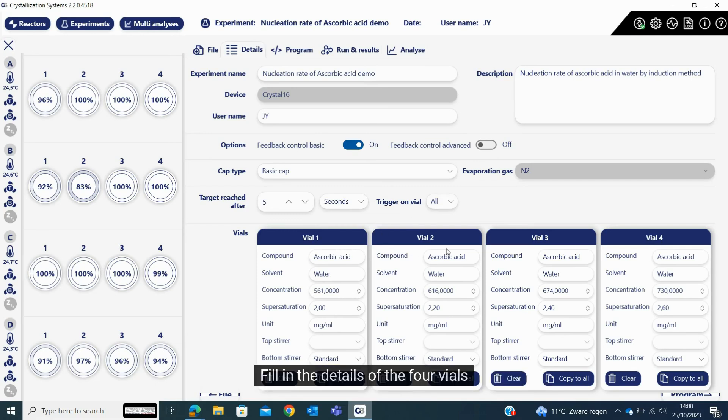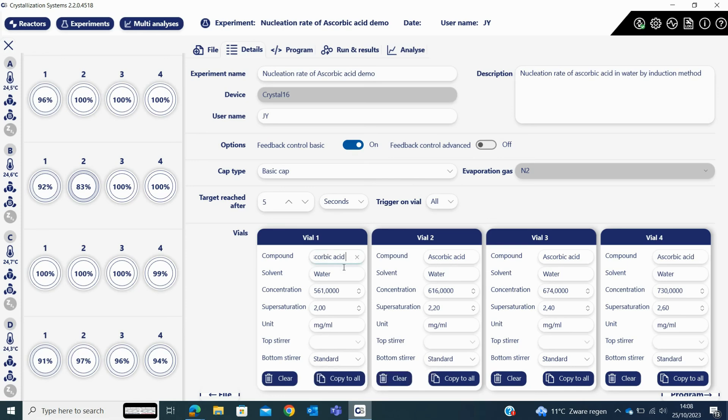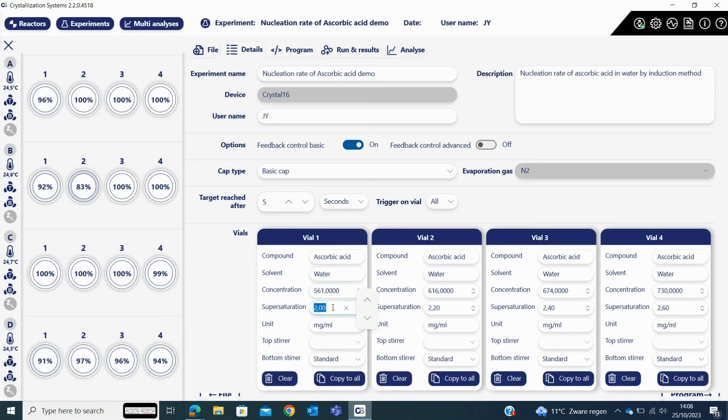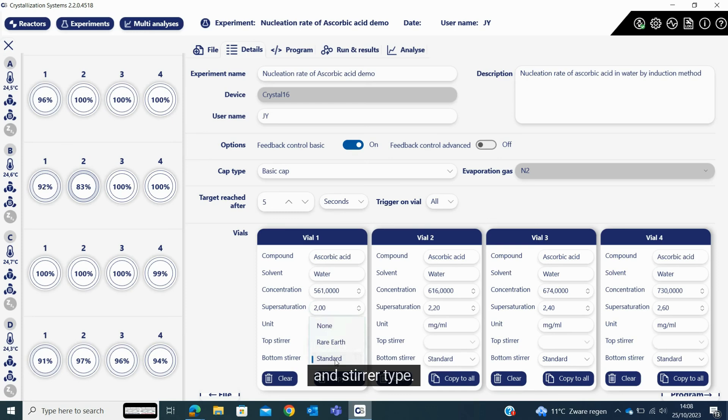Fill in the details of the four vials, such as compound, solvent, concentration, supersaturation, and stirrer type.